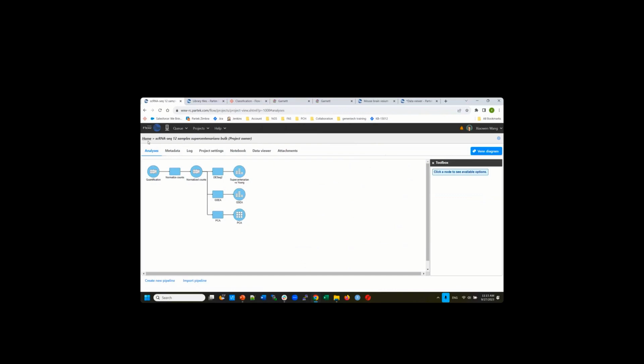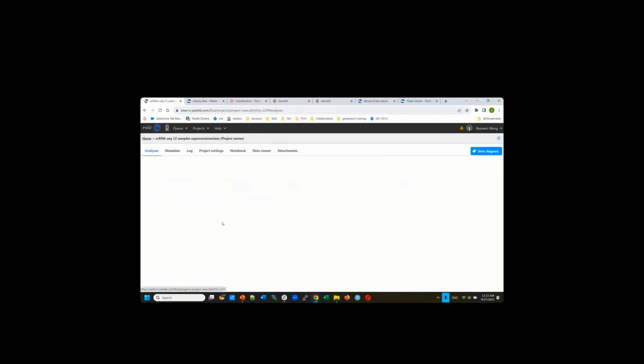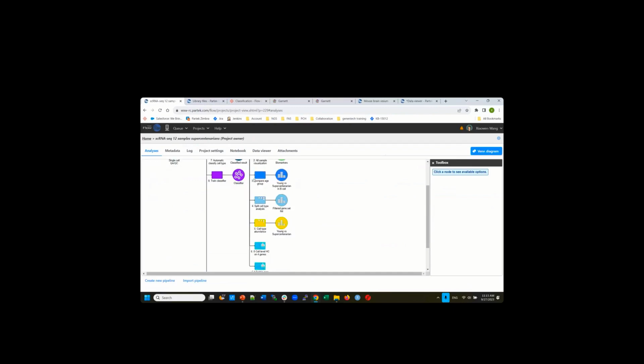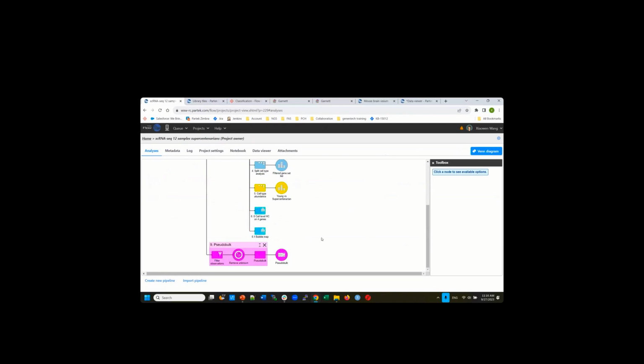Okay, with that, I'm just going to wrap up the single cell RNA-seq from multiple samples analysis. We talked about how to visualize the data individually, classify the cells individually, and combine them together to visualize them. Not only can you detect differentially expressed genes, we can also look at the different cell numbers between your phenotypes. And we also talked about the automatic cell type classification and a pseudobulk analysis.